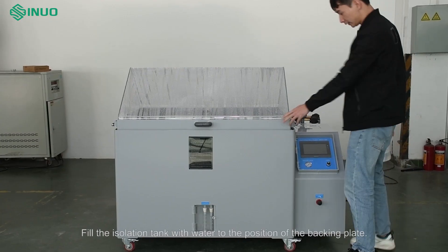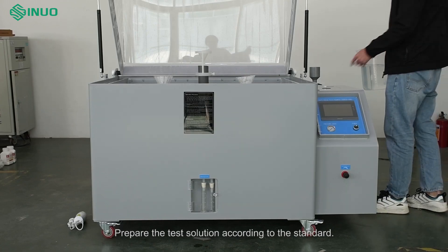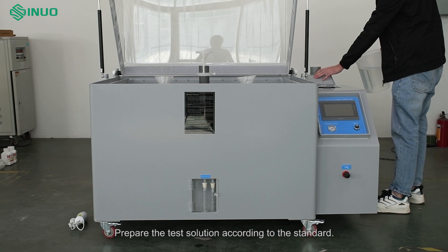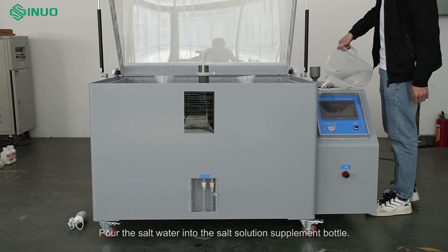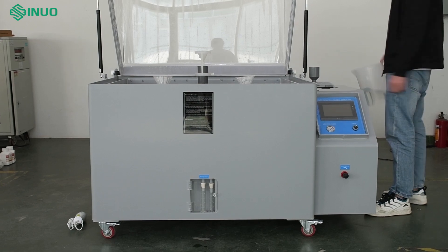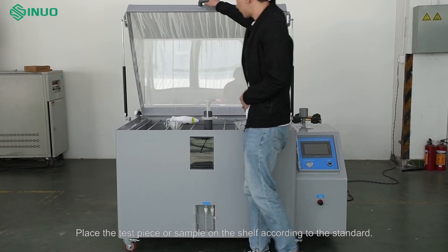Fill the isolation tank with water to the position of the backing plate. Prepare the test solution according to the standard, then pour the salt water into the salt solution supplement bottle. Place the test piece or sample on the shelf according to the standard.